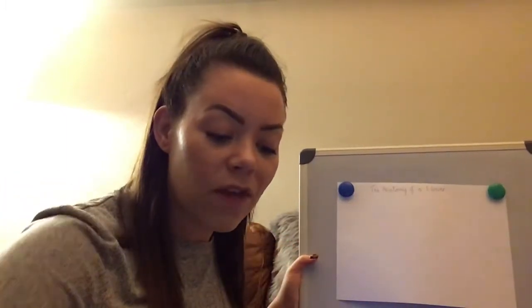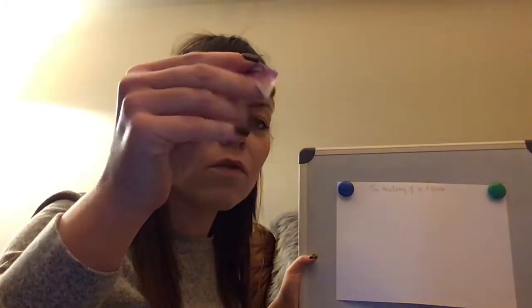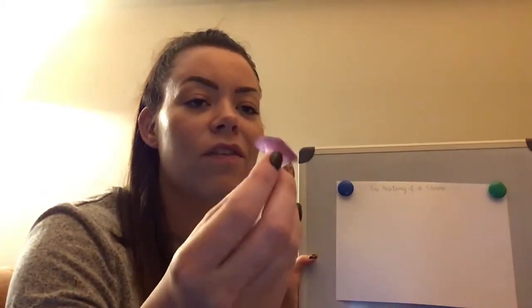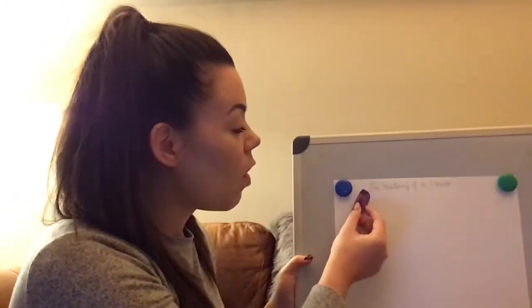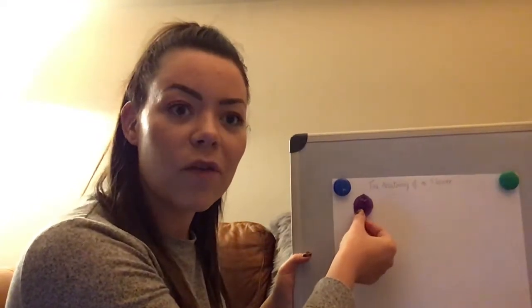Now, as I picked it up, actually, something fell off it that we can use for our dissection. We probably all know what this bit's called, hopefully. It's the colourful bit that attracts the insects. It's called the petal. So all I'm going to do is stick this on my page with my sellotape and label what part it is. Just give me a moment.